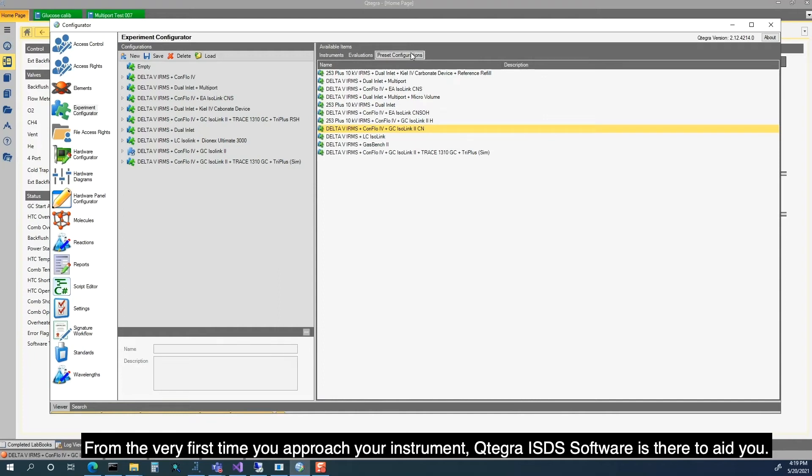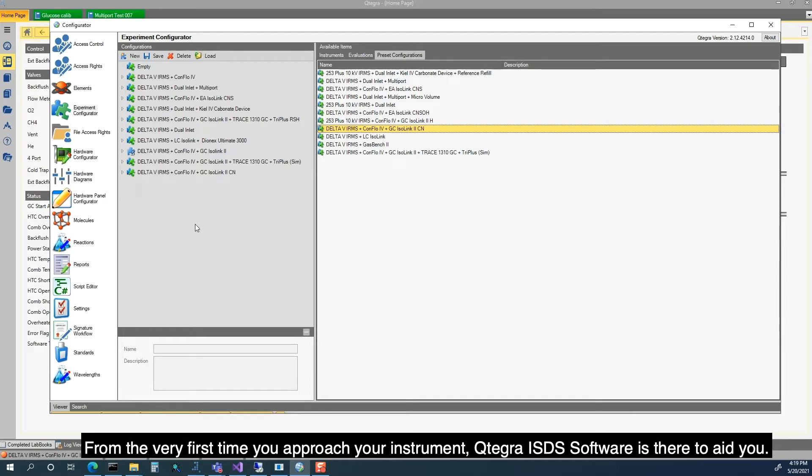From the very first time you approach your instrument, Qtegra ISDS Software is there to aid you.